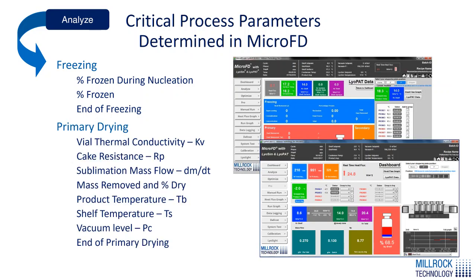In primary drying, we collect critical process parameters including vial heat transfer coefficient, otherwise known as KV; cake resistance, otherwise known as RP; sublimation mass flow; percent dry; product temperature; shelf temperature; vacuum level. We can also determine the end of primary drying. These screens that you see here are dynamically updated during the process continuously.